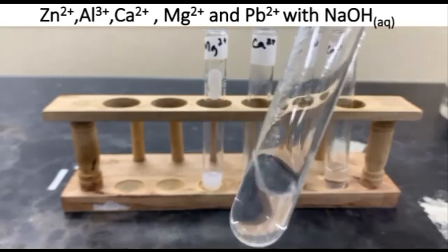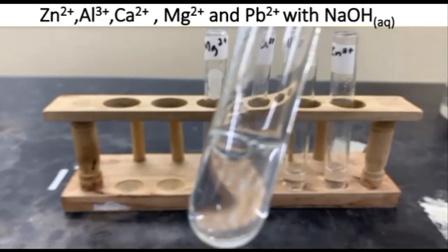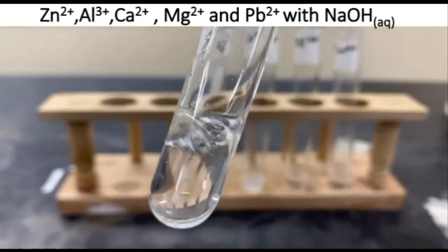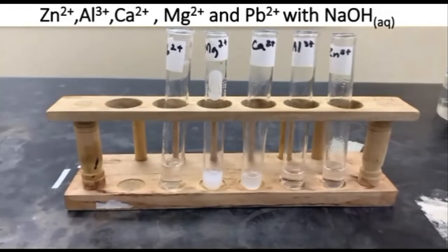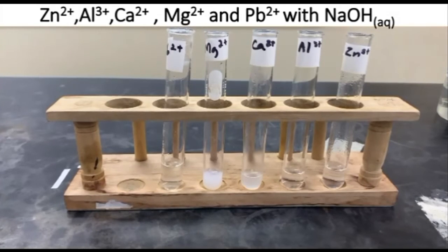So there we're seeing that our lead precipitate has dissolved in excess sodium hydroxide. So of the 5 ions, we have 3 of them dissolved.